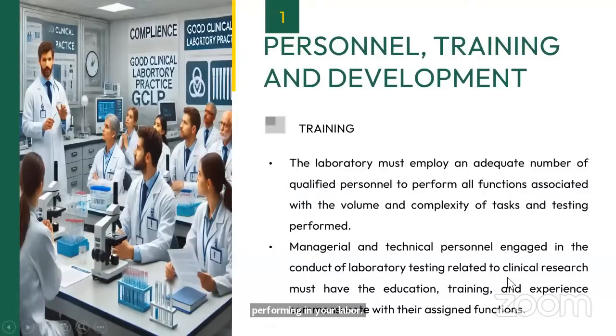Managerial and technical personnel engaged in the conduct of laboratory testing related to clinical research must have the education, training, and experience commensurate with the assigned function. So whatever responsibilities and functions have been assigned to them, their level of education should be as per that.